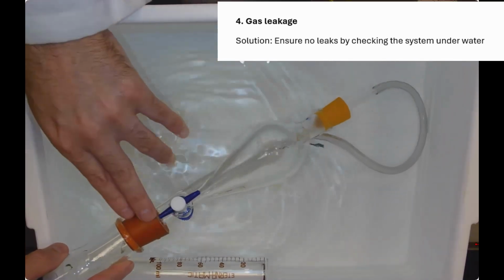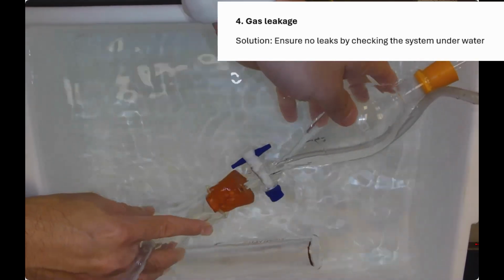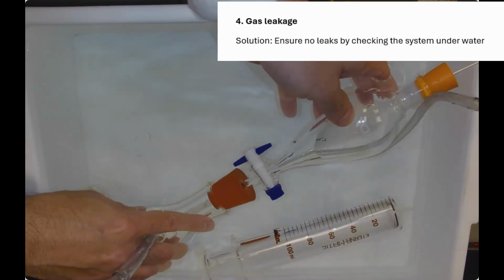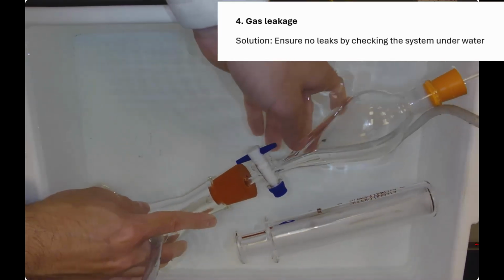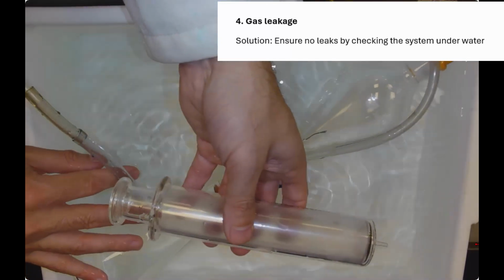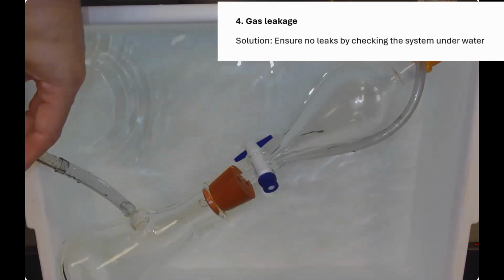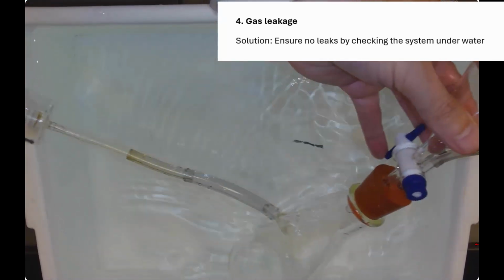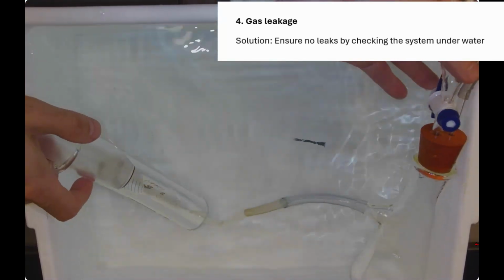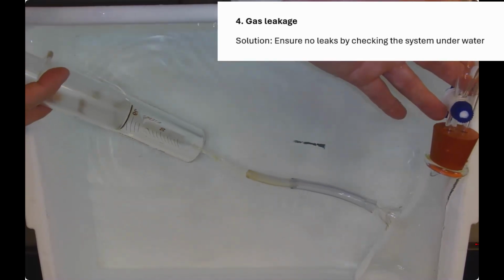And so what I'm showing you here is how to deal with that. You just put the whole system under the water. You'll feel the pressure, so the gas will be under pressure a little bit as you push it under. And so that will hopefully show any of the gas bubbles coming out, if there are any leaks in the system anywhere. And this one's all clear. There are no bubbles coming out in any of the parts.